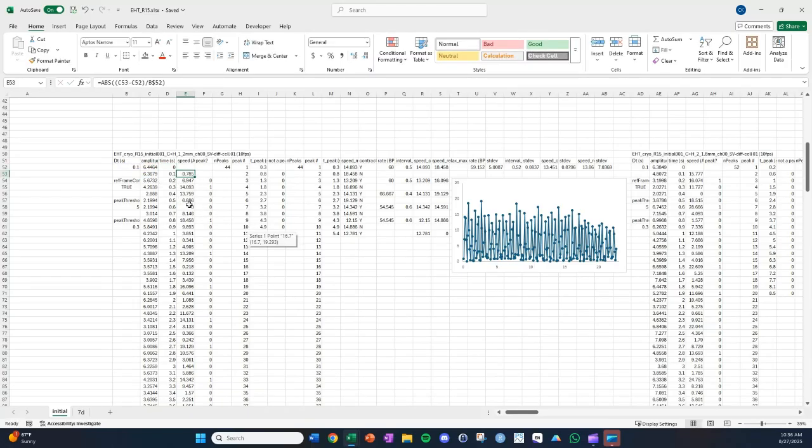But I think it doesn't end up mattering too much which time point you associate the speed at. And since it's speed, I took the absolute value of it, right? Because what we care about is speed. And later, I actually distinguish between whether it's a contraction or relaxation, using the direction of that, using the velocity.